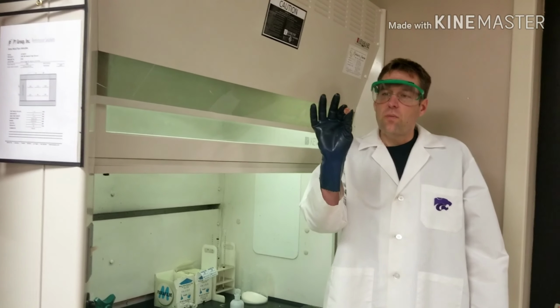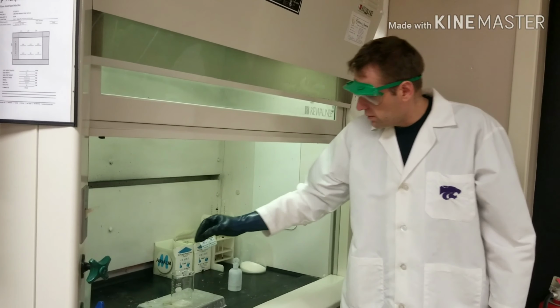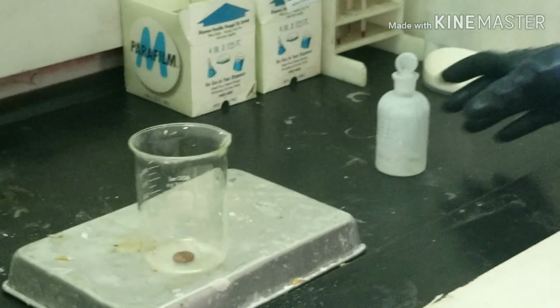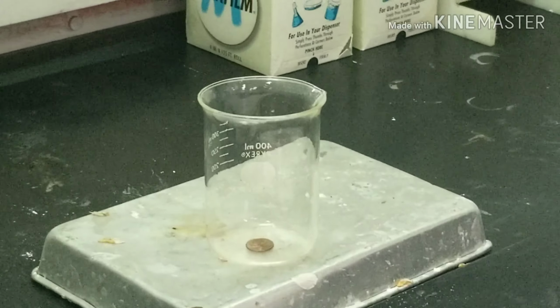All right, so here is our penny we're going to use. That's going to be the copper part of the reactant. I'm going to drop it in this beaker. Then I have nitric acid in here. We're going to dump the nitric acid over the penny and then watch the reaction.